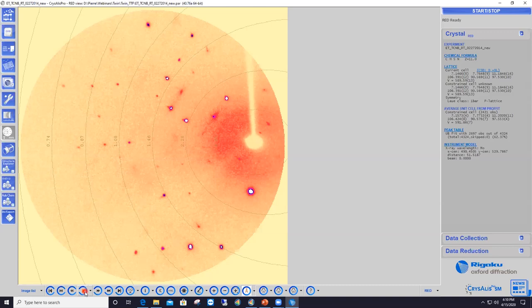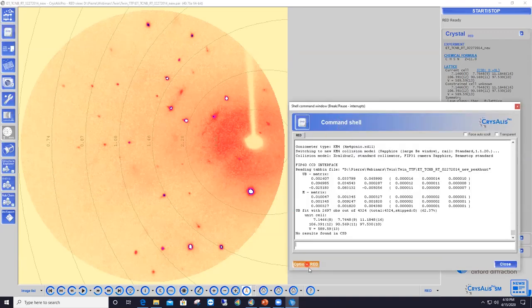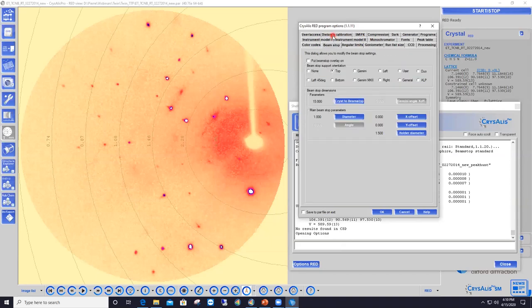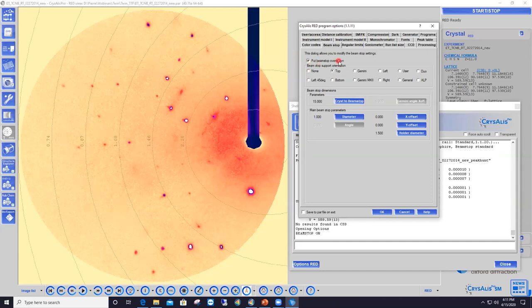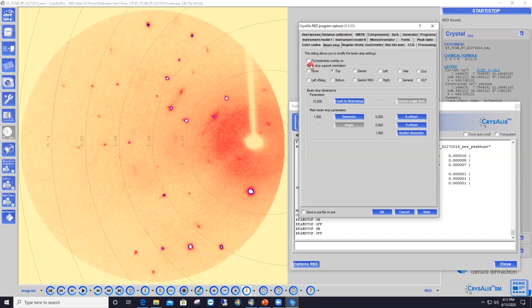Now let's jump into data processing. First, create a mask to properly hide the beam stop shadow so the program doesn't try to integrate data behind it. Open the Command Window power tool, click Options, and select Beam Stop Mask. Display the beam stop mask — it needs to be adjusted in size and position, as it doesn't currently coincide with the shadow, which is slightly tilted to the left.